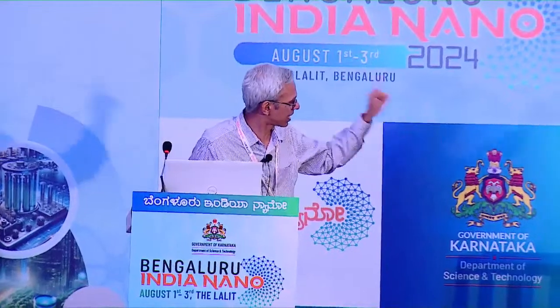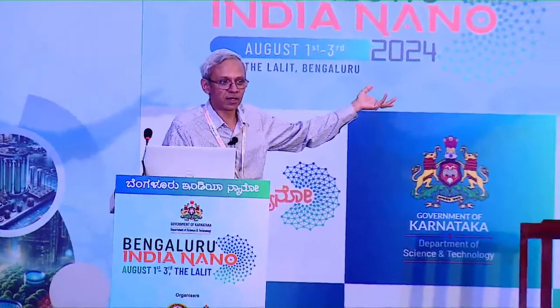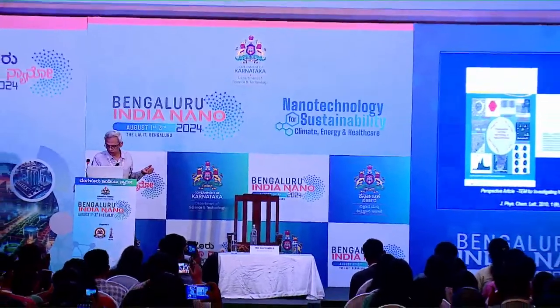For those of you who are interested, they wrote this article several years back, but it captures the different things that happen in an electron microscope and how you can use it to investigate nanostructures. If you're interested, you can go through this.